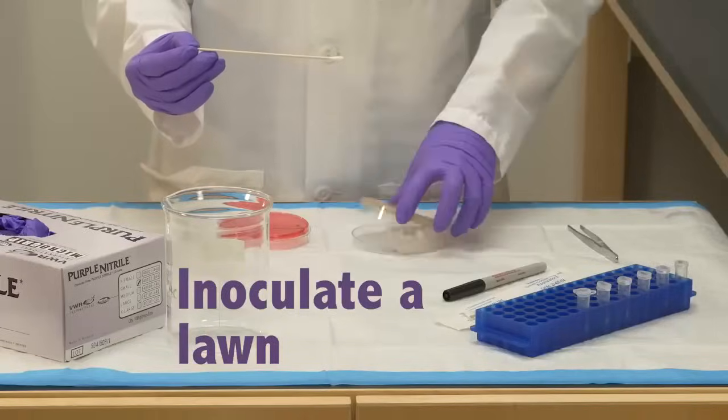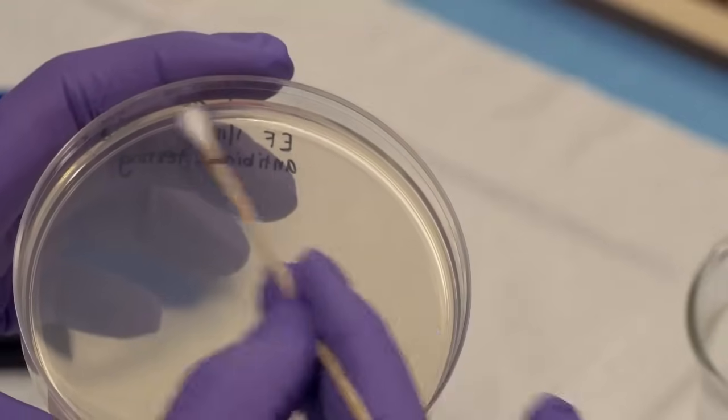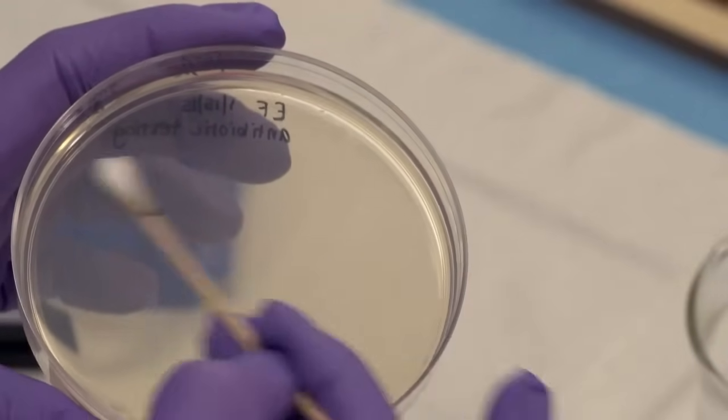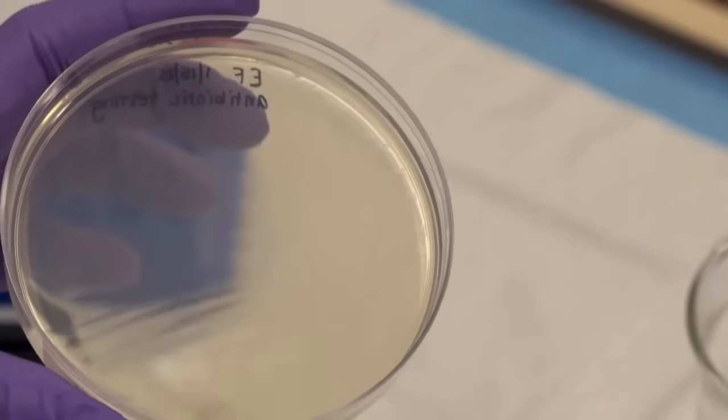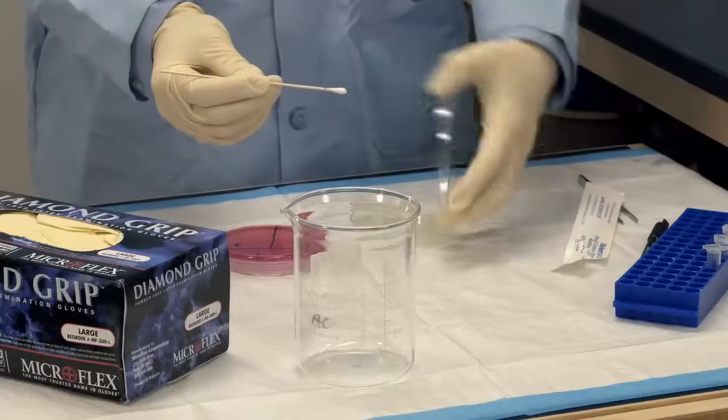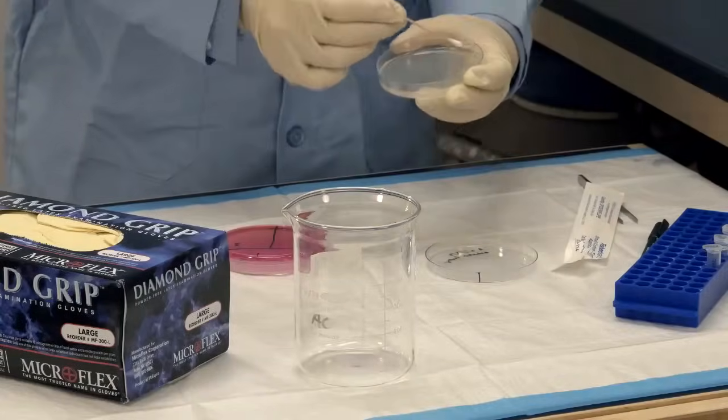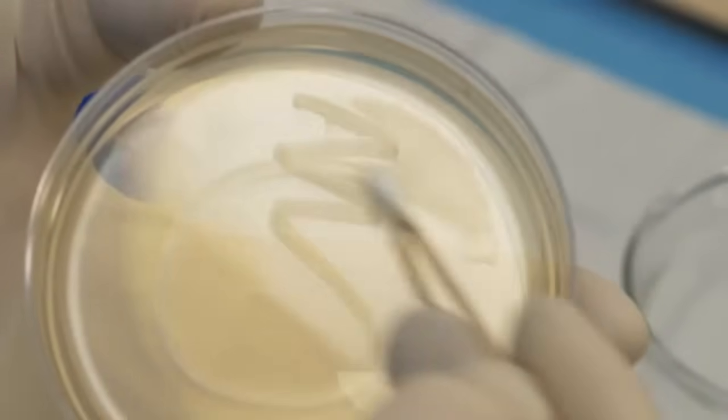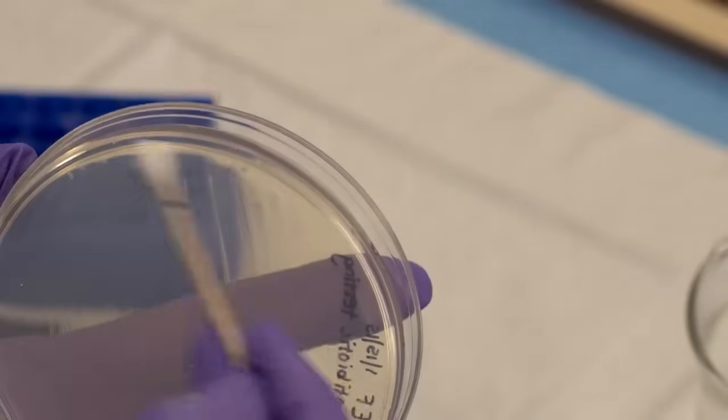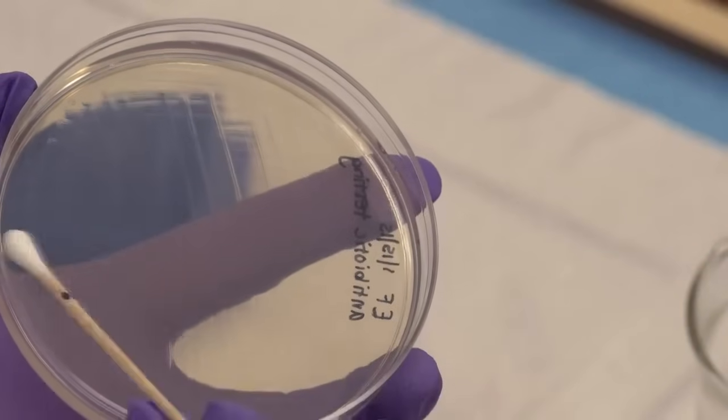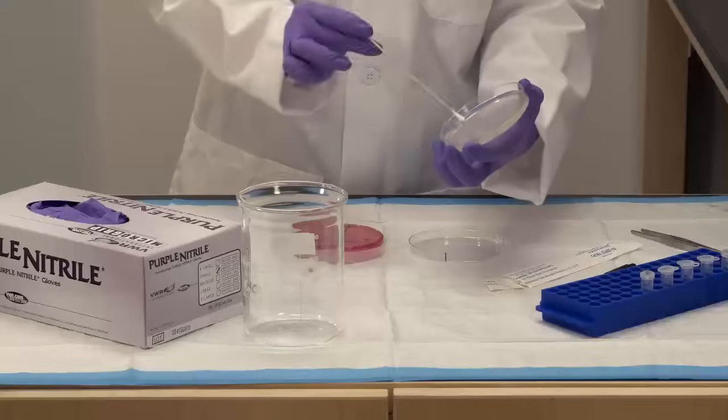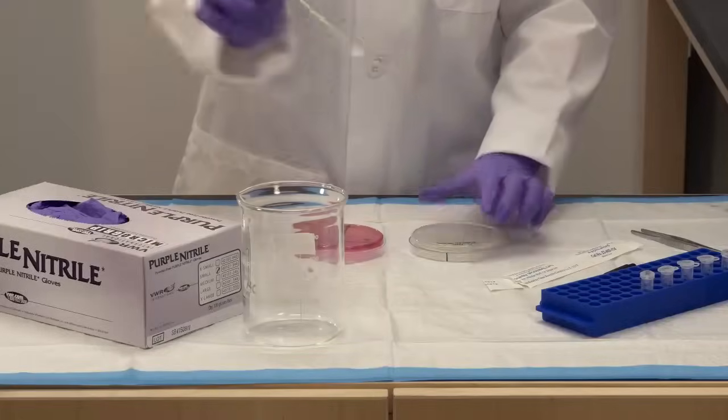Now, inoculate a lawn on the blank plate by spreading the bacteria evenly. It's important to cover the whole plate. You can spread the bacteria again in the perpendicular direction. Discard the bacteria covered swab in a waste container.